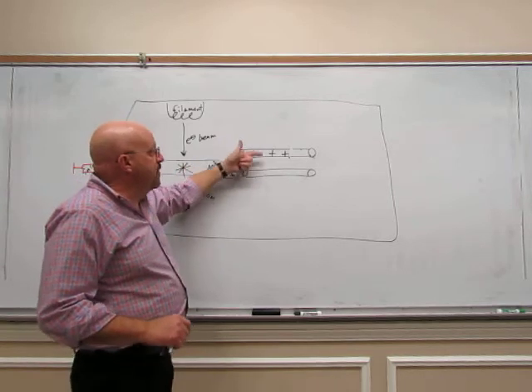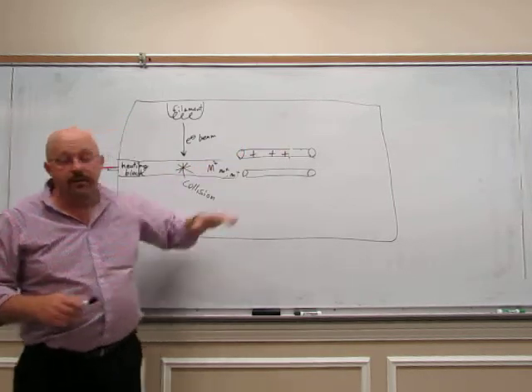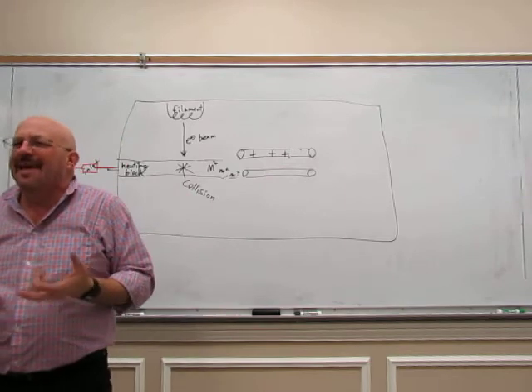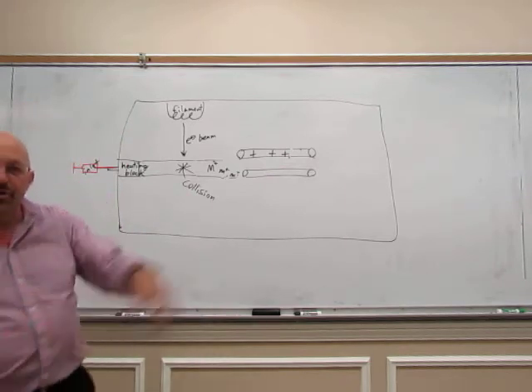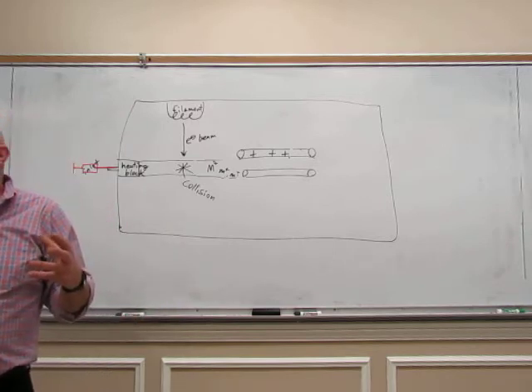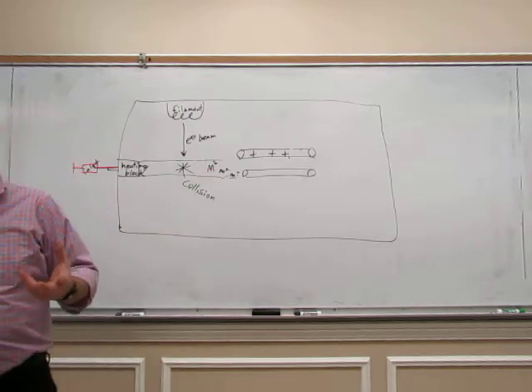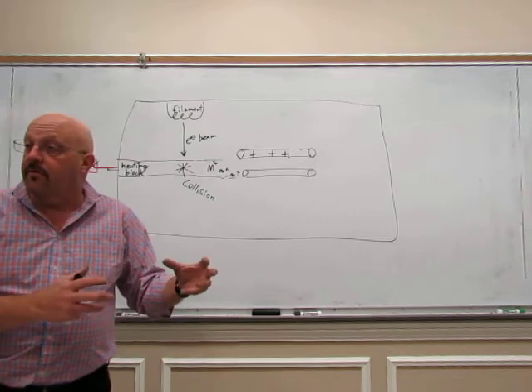Now, the other purpose of the poles is as we change the voltage on these, you can imagine these pieces coming through. The smaller pieces, being lighter, being smaller, they don't weigh as much, they're going to shoot through much faster. Your bigger pieces, huge big old pieces of the molecule, or maybe the original molecule where all we did was lose an electron, much heavier, they're going to move through at a slower pace.